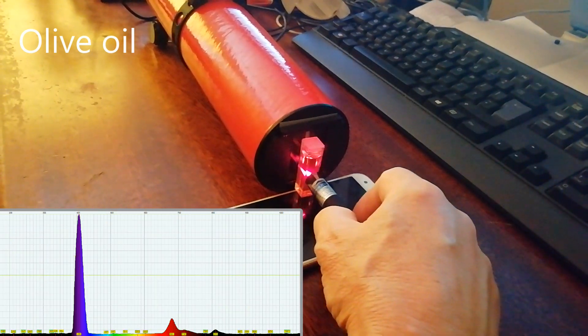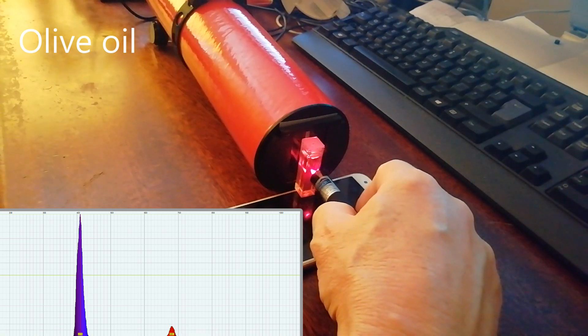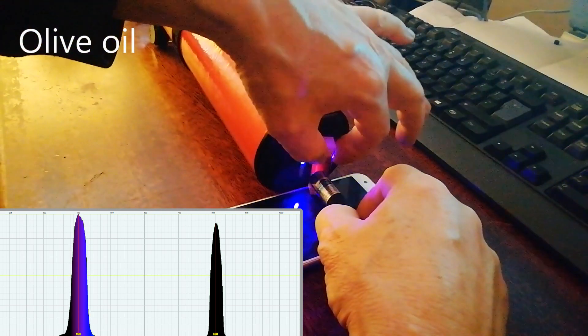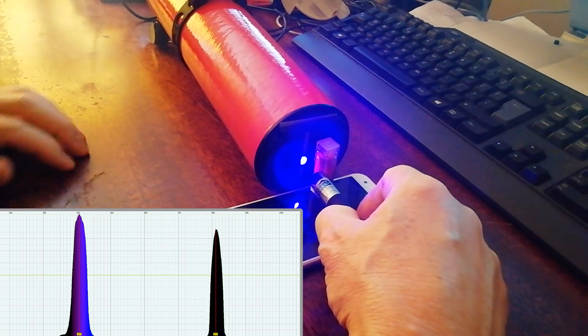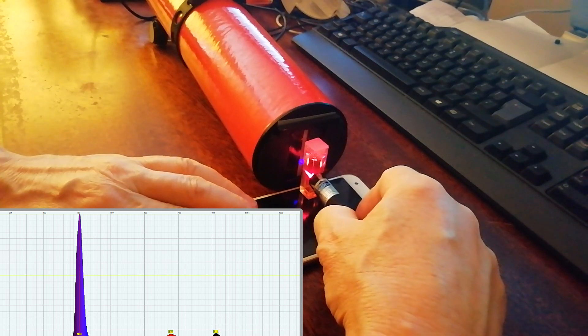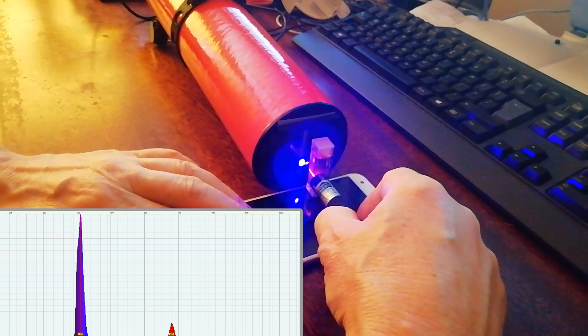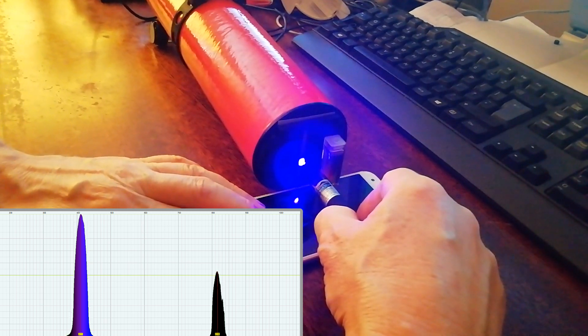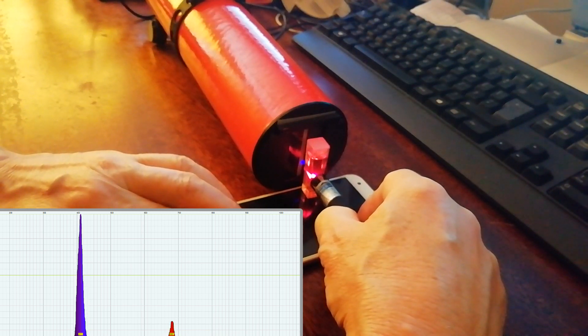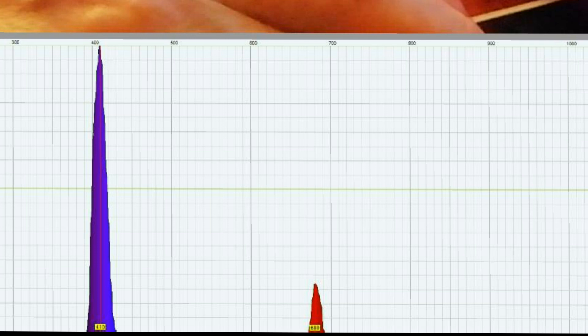I'm going to offset the vial or the cuvette so that you can see there's no red radiation coming from the laser pointer at all, just those two infrared peaks we saw earlier. And then when we move the vial into place, the infrared peak disappears and a red peak appears — that's purely the fluorescent light being generated inside the olive oil when its atoms and molecules are stimulated by the laser pointer. Looking at the IFOS display, we can see that that fluorescence is about 670 to 680 nanometers, which is exactly what the literature expects.